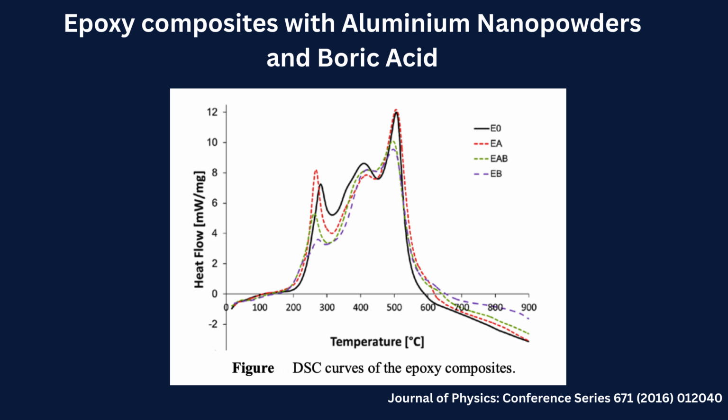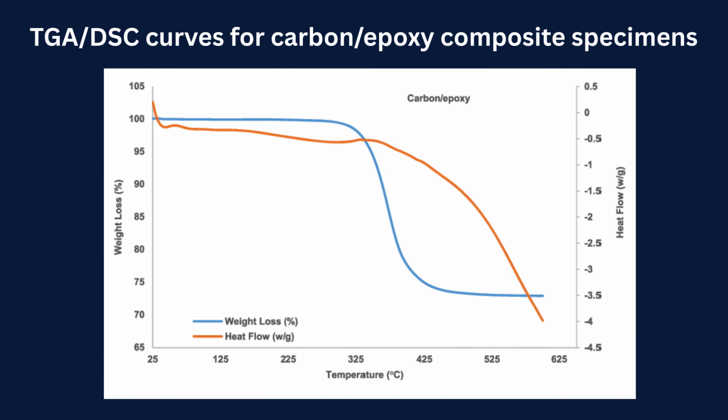Composite materials. In fiber-reinforced composites, DSC evaluates matrix curing behavior, glass transition temperature, residual cure, thermal aging, effects of fillers, and reinforcements. For carbon fiber/epoxy composites used in aerospace applications, DSC is routinely employed to determine cure schedules and monitor manufacturing quality. Research and development. Scientists use DSC to optimize processing conditions, investigate structure-property relationships, and develop high-performance materials with tailored thermal characteristics.